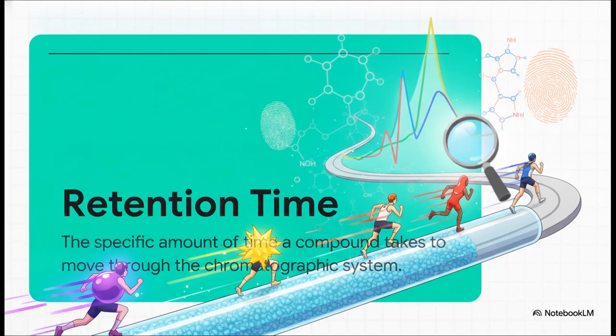It's the specific amount of time a compound takes to make its way through the entire chromatographic system. Because every chemical has a totally unique set of properties, its retention time under specific conditions acts exactly like a fingerprint. That's what allows us to identify mystery molecules with extreme sensitivity.